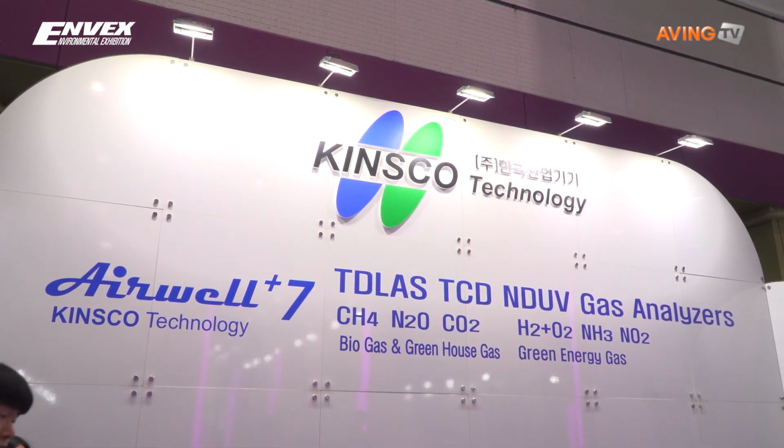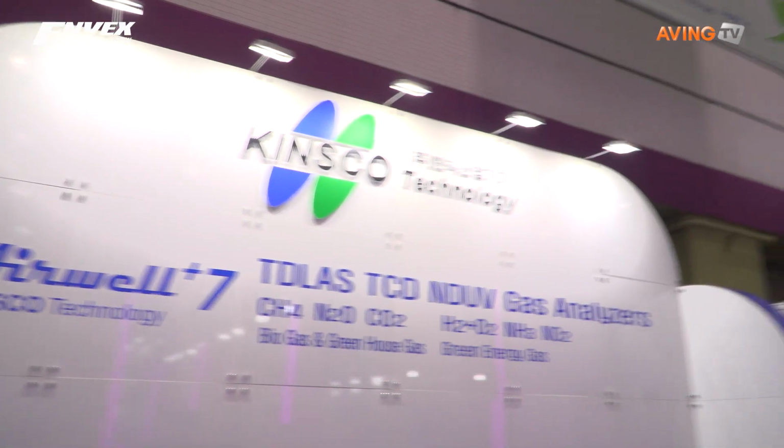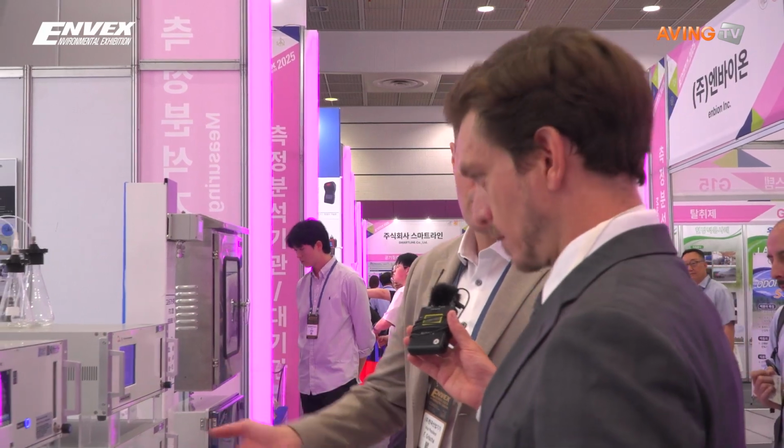So tell me about your company and what products you're showing today. Okay, so basically Kinsco is our Korean distributor from Ecophysics. So I'm actually representing Ecophysics, which is this analyzer over here. Kinsco covers a wide range of different suppliers. As you can see here, the Airwell products are distributed and partially developed by Kinsco, and over here, laser performing analyzers, also UV they have.